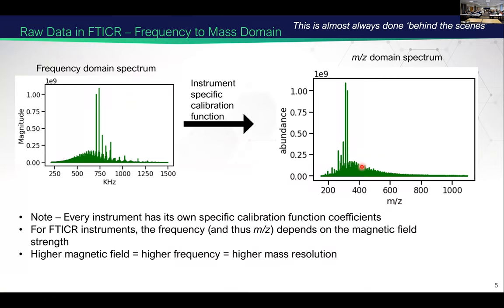So the 12 Tesla that you would have used a couple of years ago, here's the 30-second explanation of FTICR. It's not just the magnet; you've got the upfront part where the ionization process happens. Say, for example, with ESI, maybe 1% of molecules are successfully ionized. And because of various losses, not all of them make it from the ionization source into the instrument. On newer or cleaner instruments, that percentage is higher, so you just get better sensitivity upfront.